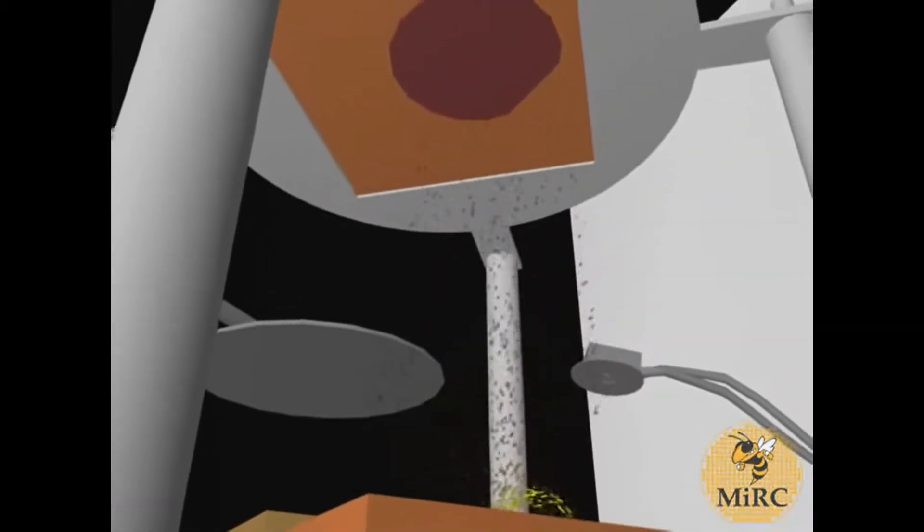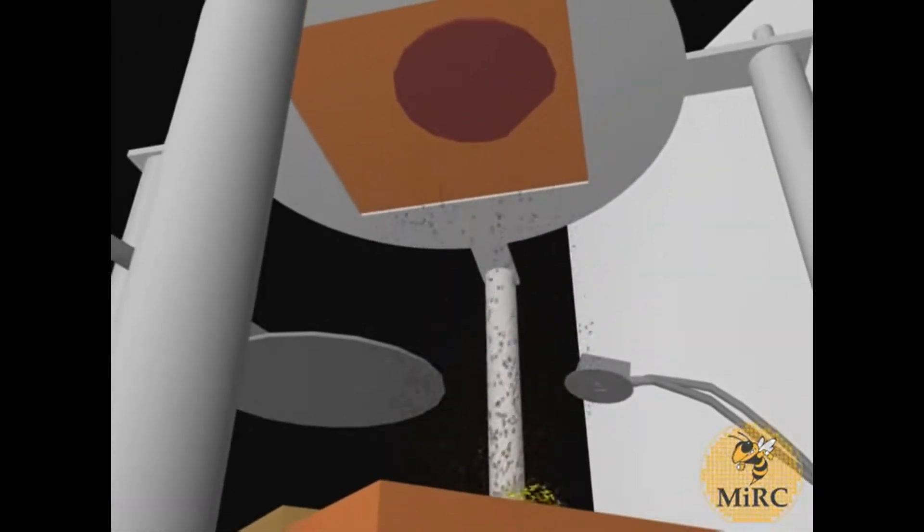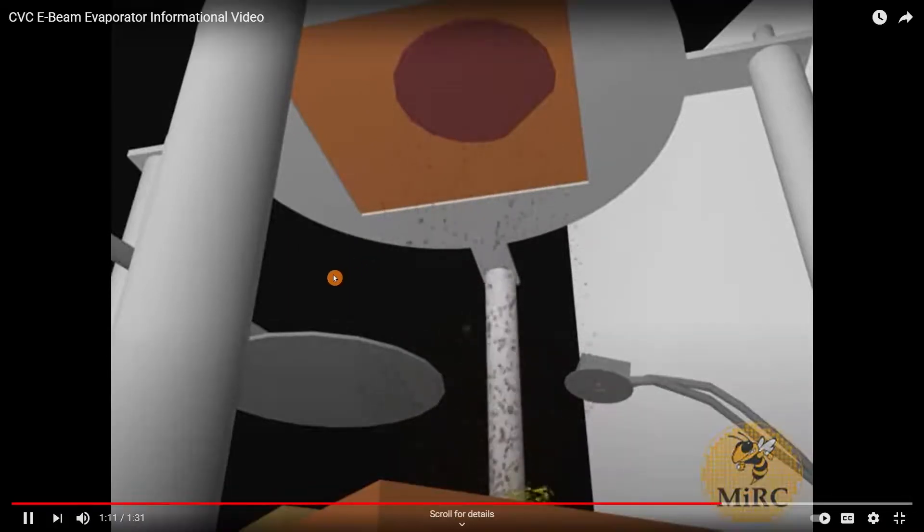Once the desired rate is reached, the shutter is opened and the sample is exposed to the evaporating metal. The desired rate of evaporation and the amount of metal to be evaporated can be set using the deposition controller.